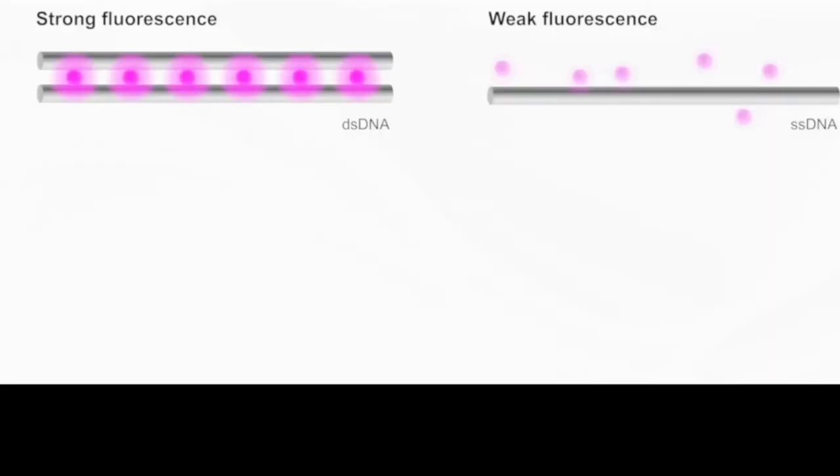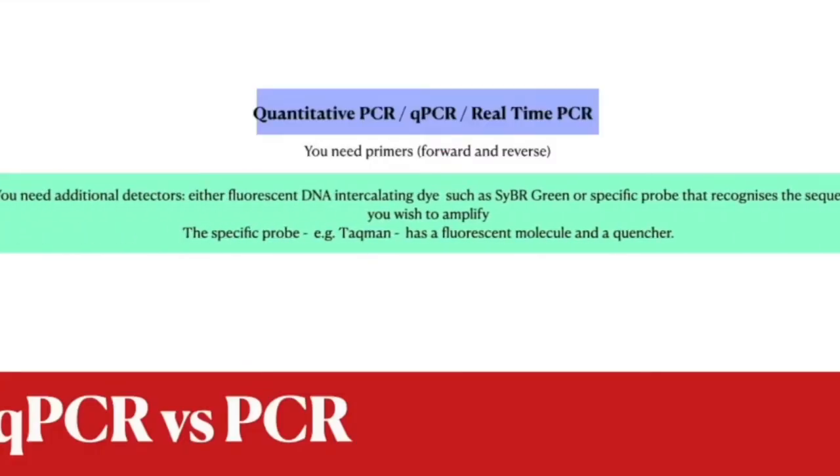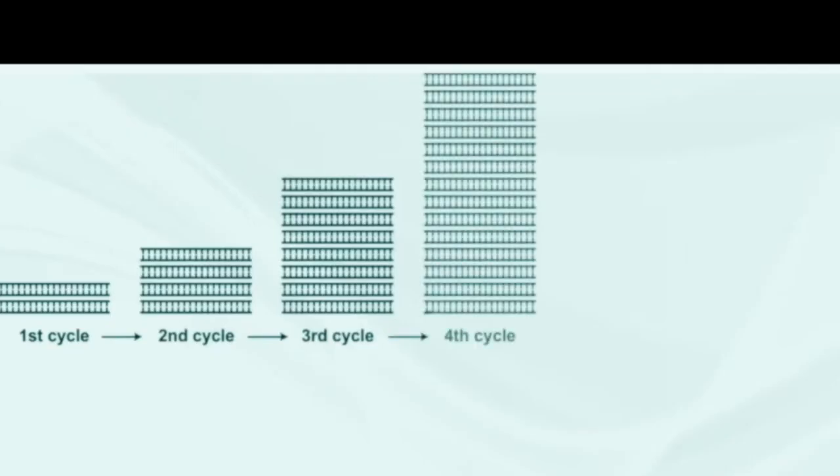You need to determine the efficiency of the primers once you design them. Is it clear to you why you need to determine the efficiency of the primer? If it is, let me know in the comments. And so once you have these primers that you trust, you can now use them to detect or measure the expression of the gene that you are interested in.